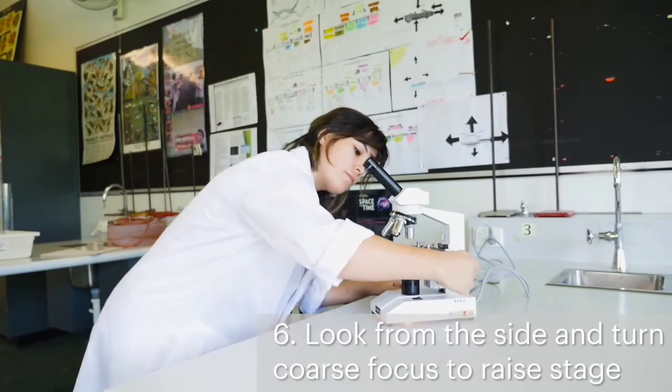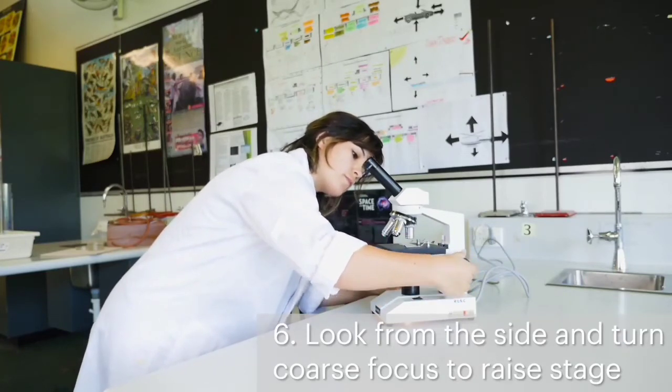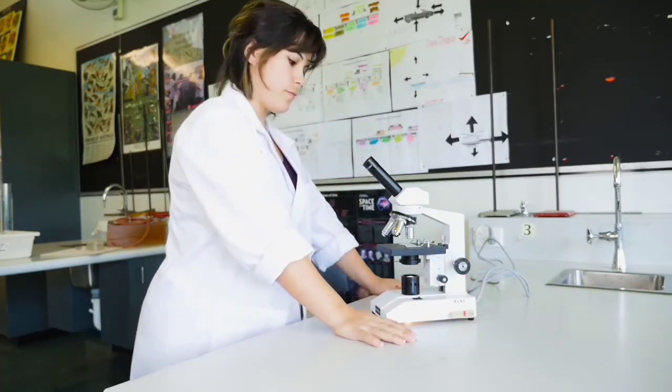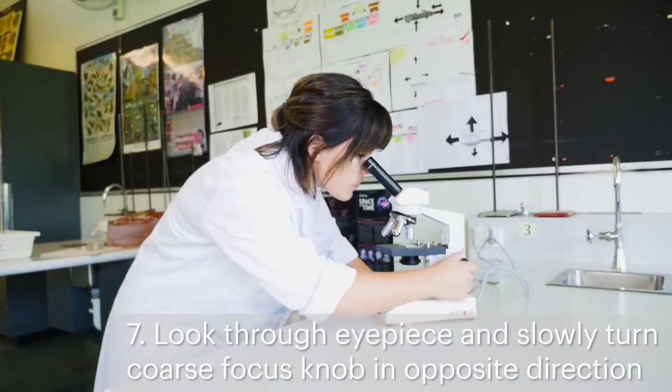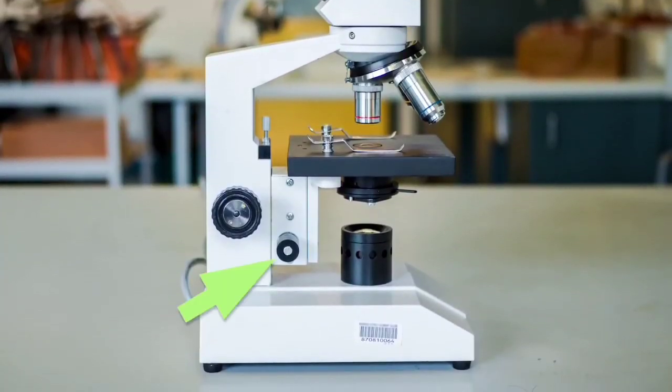Look from the side while you turn the larger coarse focus knob to move the stage up to its highest position, close to but not touching the objective lens. It's important to look from the side so you don't risk smashing the slide or the objective lens by going too far. Now you can look through the eyepiece and slowly turn the coarse focus knob in the opposite direction to focus on the specimen. If you turn the knob too quickly, you might miss the moment when the specimen is in focus. Once the specimen is roughly in focus, you can use the smaller fine focus knob to get a sharp image.